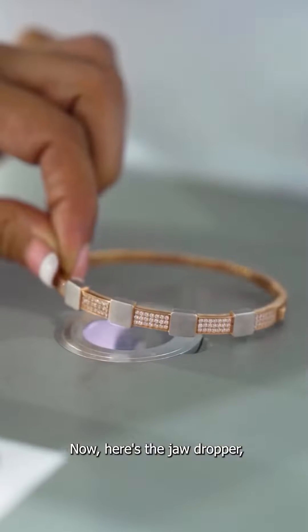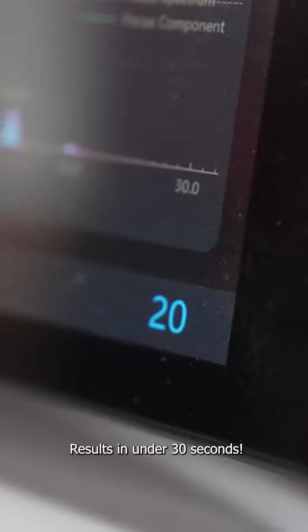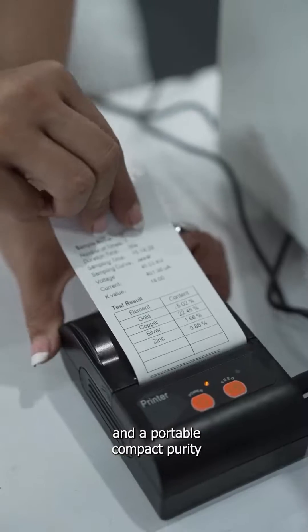Now here's the jaw dropper. You need to place your ornament, hit a button and boom — the results are in 30 seconds. It comes with its own built-in PC and a portable compact purity printing device.